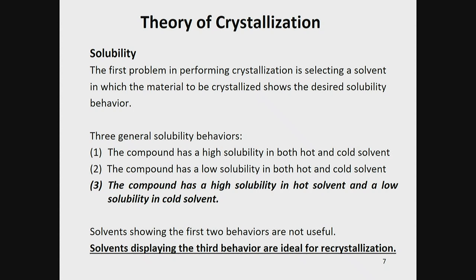But what if the compound doesn't dissolve in either hot or cold water? Then we're not going to purify it. The best behavior is characteristic number 3, where the compound is soluble in hot solvent and not soluble in cold solvent. This is very crucial, because imagine you dissolve this dirty solid in a hot liquid, and then as that liquid cools down, the solid is going to slowly come out of solution as pure crystals.